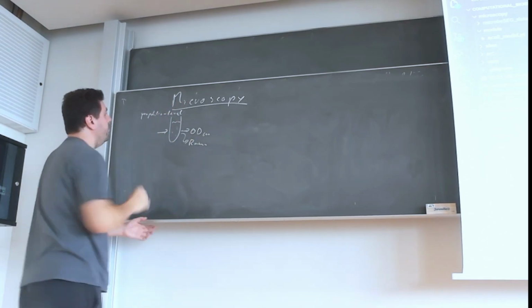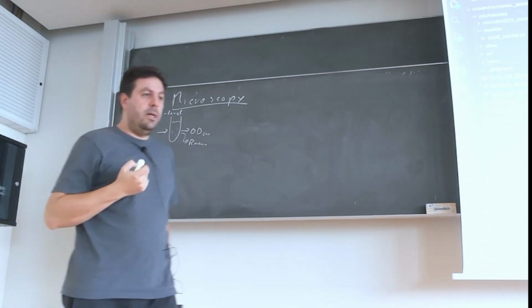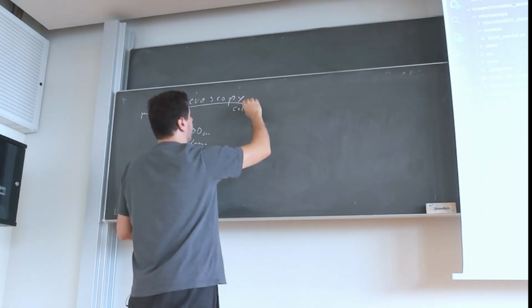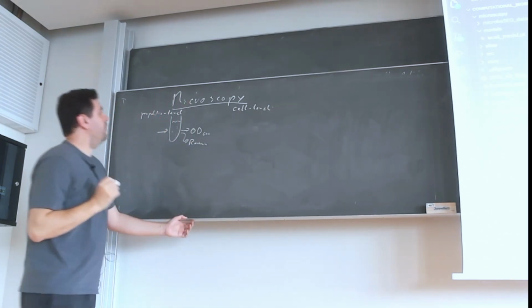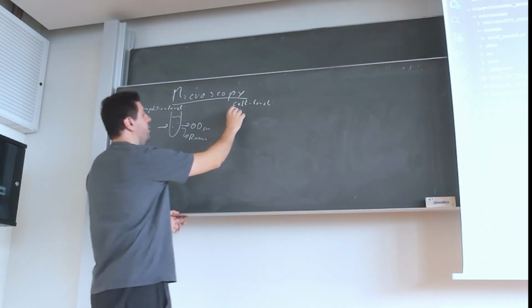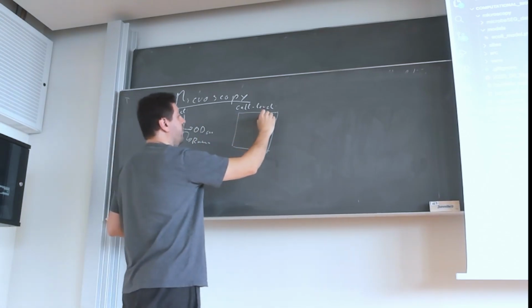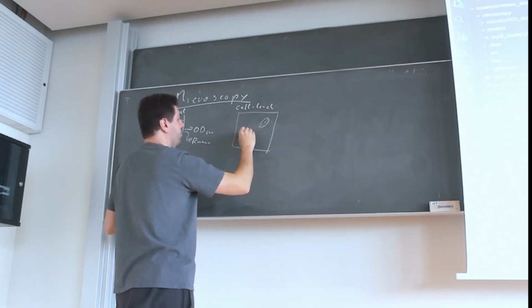And sometimes we want to take a closer look. We want to know what is the behavior of each individual cell. So this will be cell level measurements. We could have equally called this lecture cell level measurements. And what we are going to have is typically images that we made with a microscope. And you will see some bacteria cells. For example, here's a bacterial cell, and there's another bacterial cell in here.